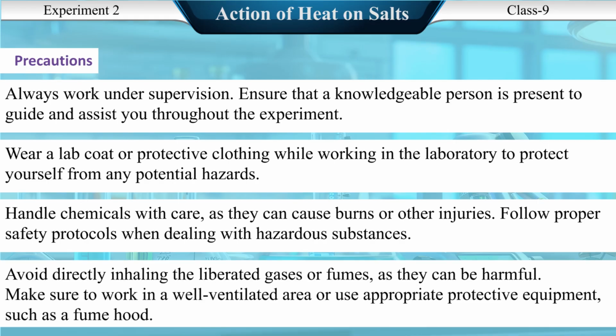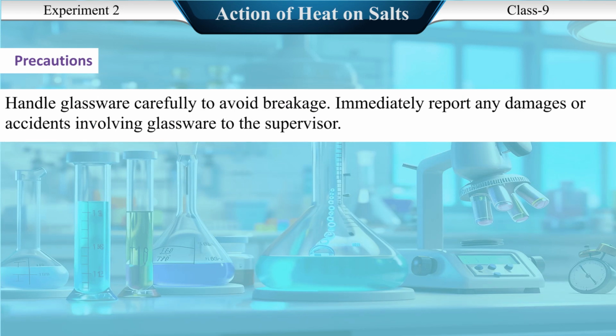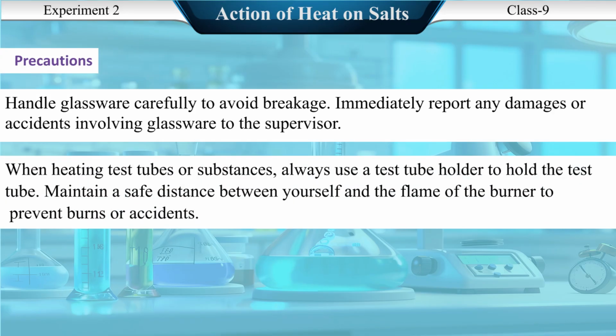Avoid directly inhaling the liberated gases or fumes, as they can be harmful. Make sure to work in a well-ventilated area or use appropriate protective equipment, such as a fume hood. Handle glassware carefully to avoid breakage. Immediately report any damages or accidents involving glassware to the supervisor. When heating test tubes or substances, always use a test tube holder to hold the test tube. Maintain a safe distance between yourself and the flame of the burner to prevent burns or accidents.